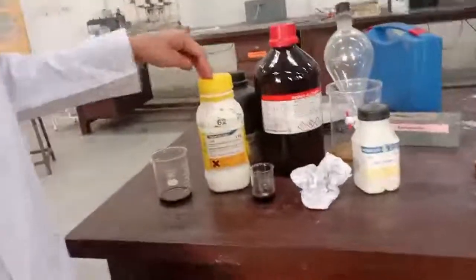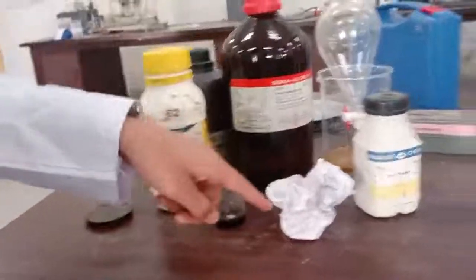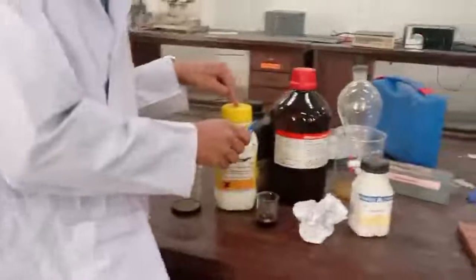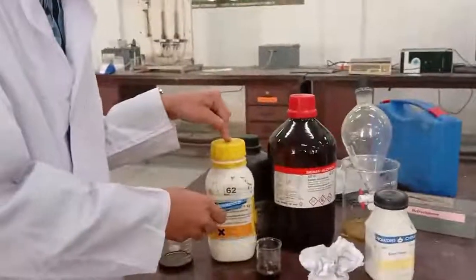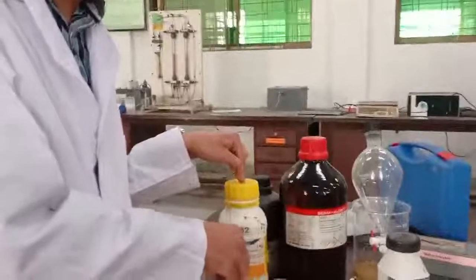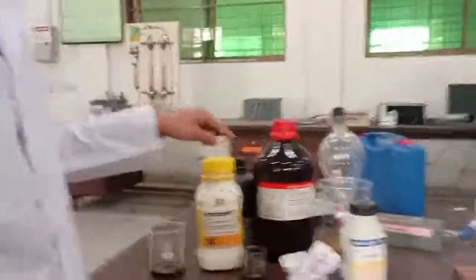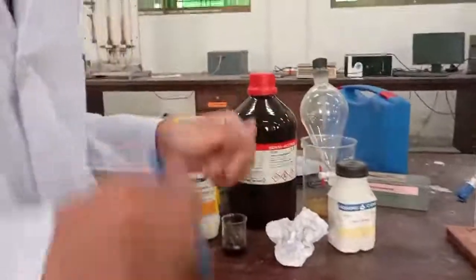To prepare the titration solution, we need all the following chemicals: number one is sodium thiosulfate, number two is sodium carbonate, and number three is starch powder. We take 100 ml of water, add 30 grams of sodium thiosulfate and 0.2 to 0.3 grams of sodium carbonate, then mix and stir it.